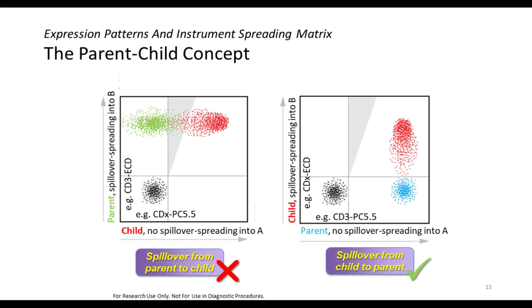And so we will be able to detect all those CDX positive cells that have a very low antigen expression density, which gives us overall the better sensitivity as compared to the case on the left. So the takeaway message here is that spillover from parent antigen into a child antigen should be avoided. Even this may override other rules like the antigen density fluorochrome brightness rule.